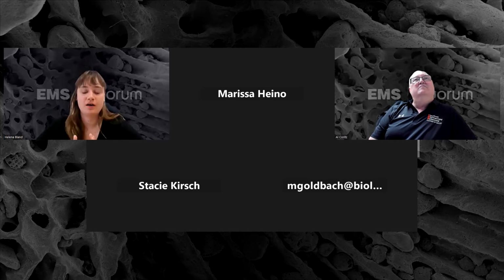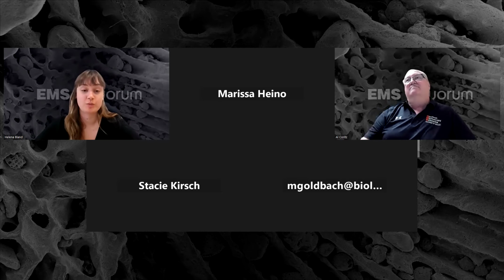With our plasma treatment and glow discharge, for cleaning I would primarily use our plasma treatment, and glow discharge would be primarily used for TEM. When we're doing our UV cleaning, we're of course using ultraviolet light. The limitation of our UV cleaner is that it's a little bit slower than our plasma treatment, but it is good for removing organic contamination. The only thing with UV is that it's surface only.